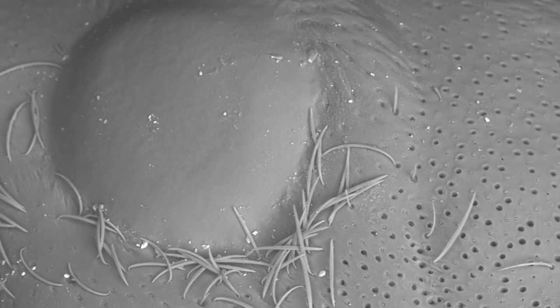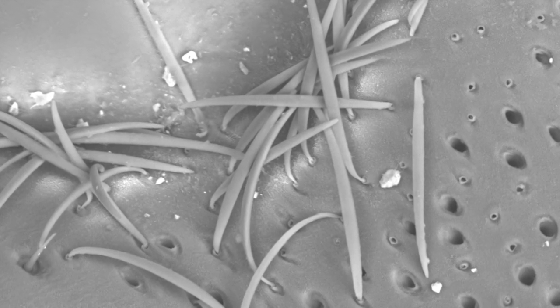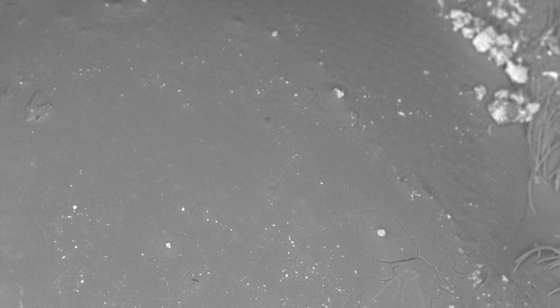So I'll leave you with a few final pictures. This one is of the cicada skin at that tri-point. Just in the face where I think it started cracking, and then this is the actual cicada itself, and so you can see the different circles there. I don't know what those things really are. I should probably look them up, but I haven't. I hope you enjoyed this and this got you interested in looking at the world a little bit differently. So here's the eye on the side, and you can kind of see the surface as we zoom in. It has multiple eyes or multiple lenses within the eye, and then of course pictures of the wing, because the wings are just gorgeous. Even though it's a cicada, I still think they're gorgeous.